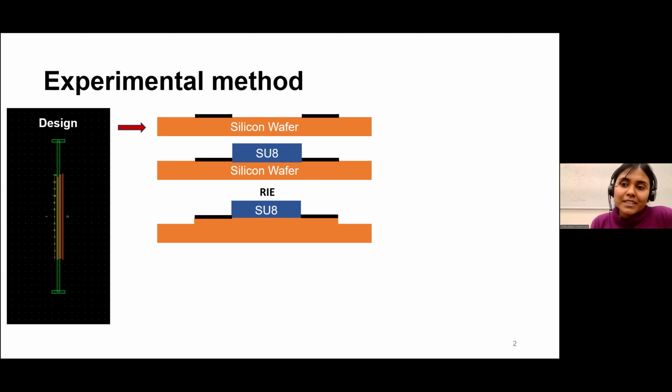In other similar studies, cells are often fixed to glass slides using different chemicals, and we have tested the effects of PLL, which is commonly used for this purpose. And we observed that PLL can affect normal cellular processes. For this study, we try to image cells as non-invasively as possible, as this knowledge has potential applications in finding novel antibiotic targets and developing synthetic cells. Therefore, we use PDMS-based microfluidic technology to achieve this goal.